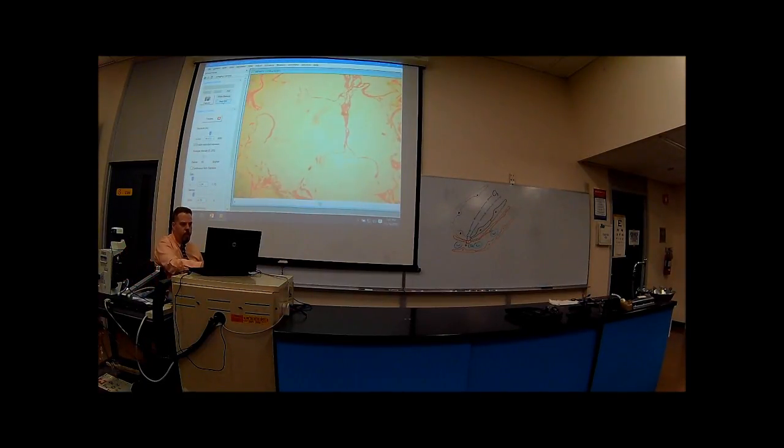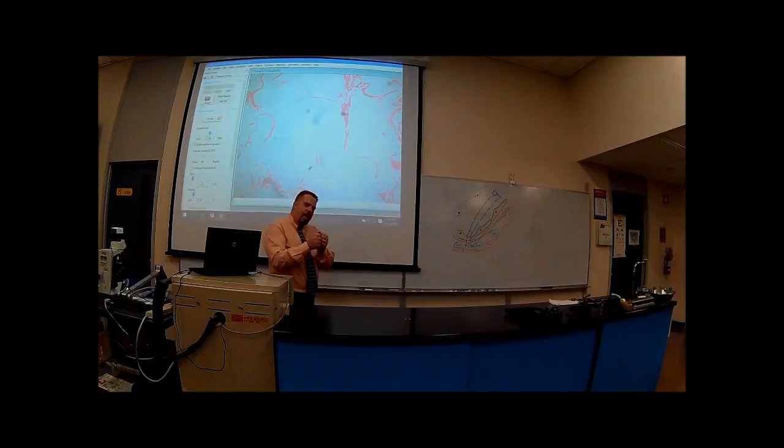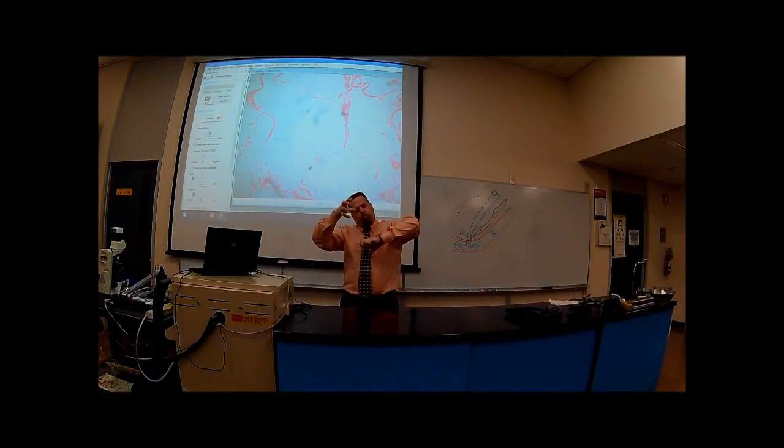So this is a new slide, or another slide. And what we got here, this is at 40x. This is still at low magnification. And this is lung tissue. But you'll notice something different about this. You'll notice, if you use the analogy that lung tissue looks like a fishing net, now we're going to take this fishing net and tear it, stretch it out.